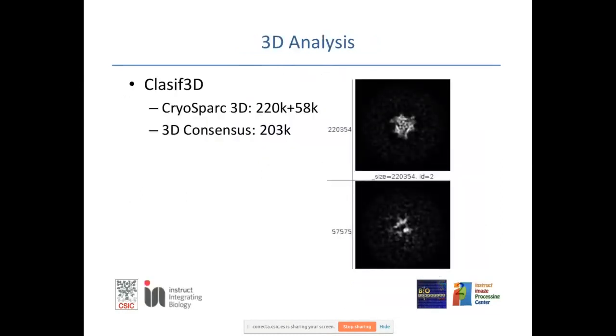Then I went to 3D reconstruction. We used for that, again, as the first step, cryoSPARC. It is so fast that, while you have many, many particles, it is worth using cryoSPARC. And later, you may decide what to use, as you have a better idea of how your particle looks. But for the first steps, cryoSPARC is really, really fast.